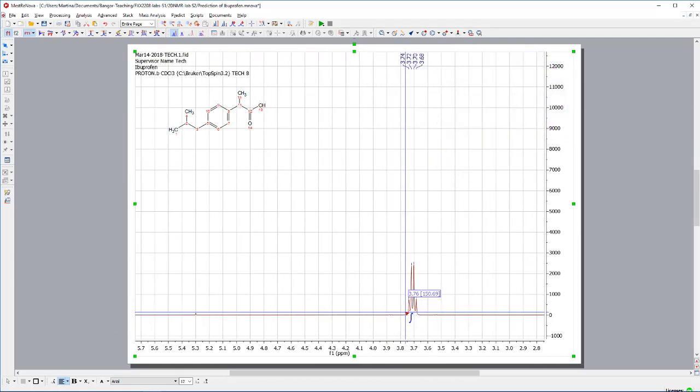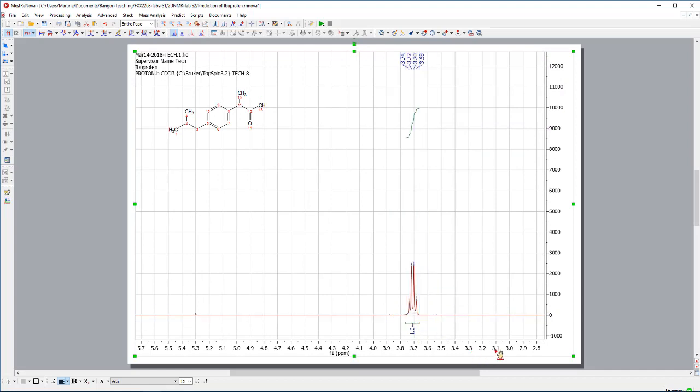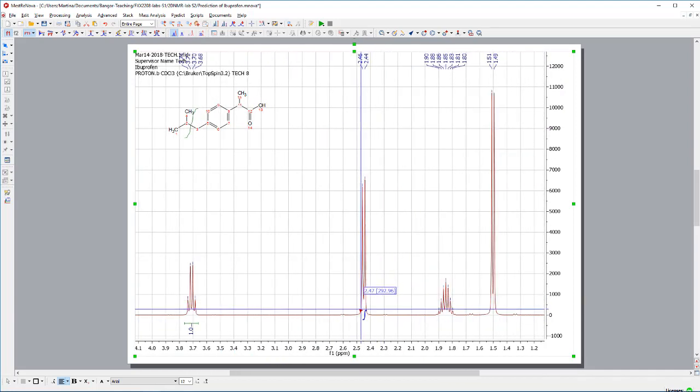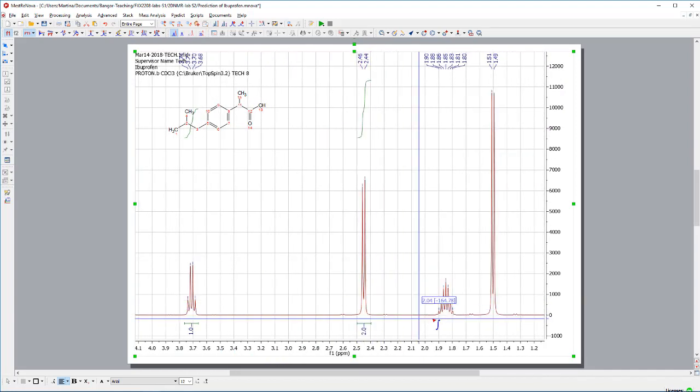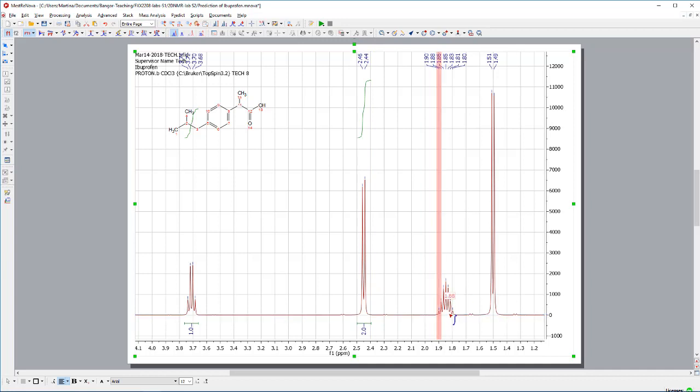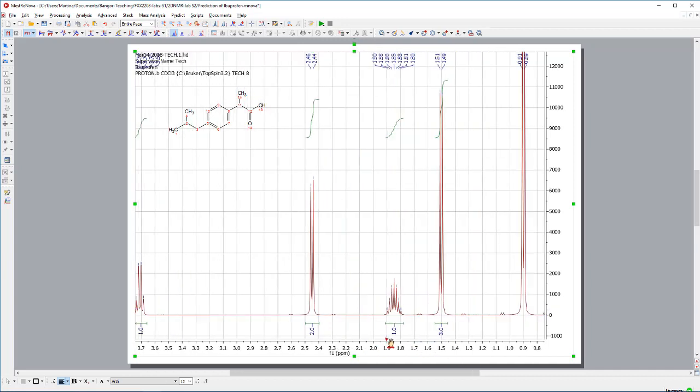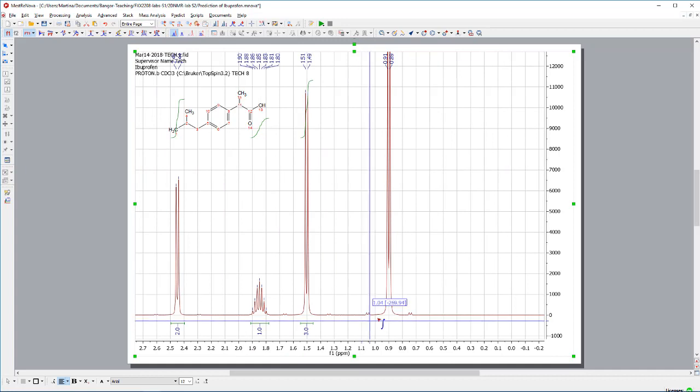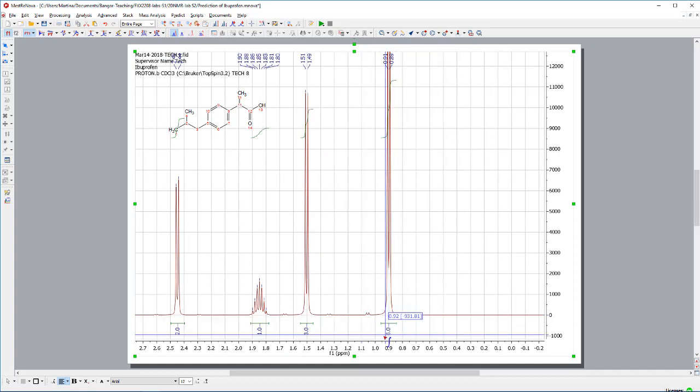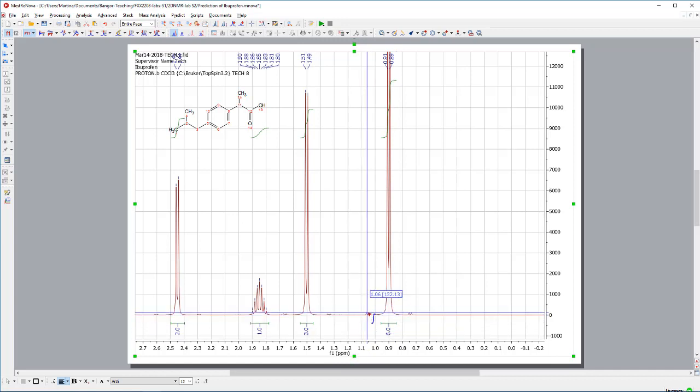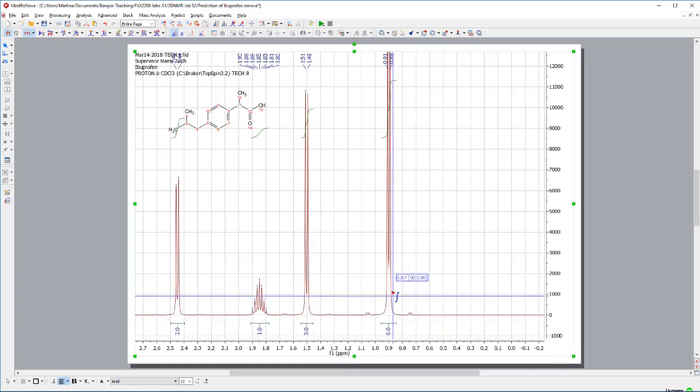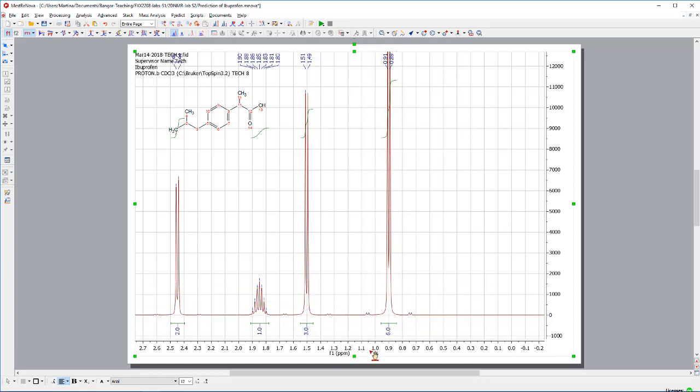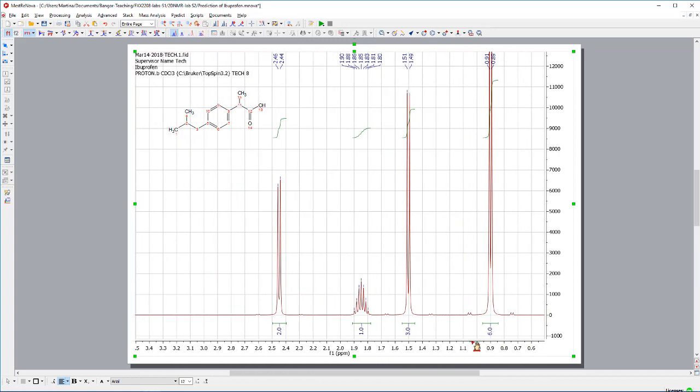And close it again. Okay. In this sense, I can go through the whole spectrum. That's one. That's two. One. This is three. And this is six. So, this sample is quite strong. You see even the couplings here to the carbon 13, which you usually don't even see.